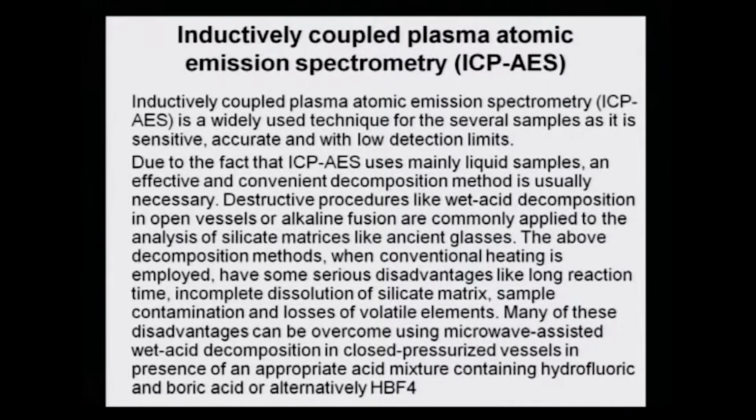So, now we know that this is a method which can be used for any and every sample, although it is sensitive and accurate and goes up to lower limit of detection. So, therefore, the only challenge that an analyzer or an analyst has to face is to be able to prepare the liquid sample most effectively and most conveniently. If the decomposition or digestion step is very cumbersome or long drawn, then it is not a very good technique and cannot be adapted by every laboratory.